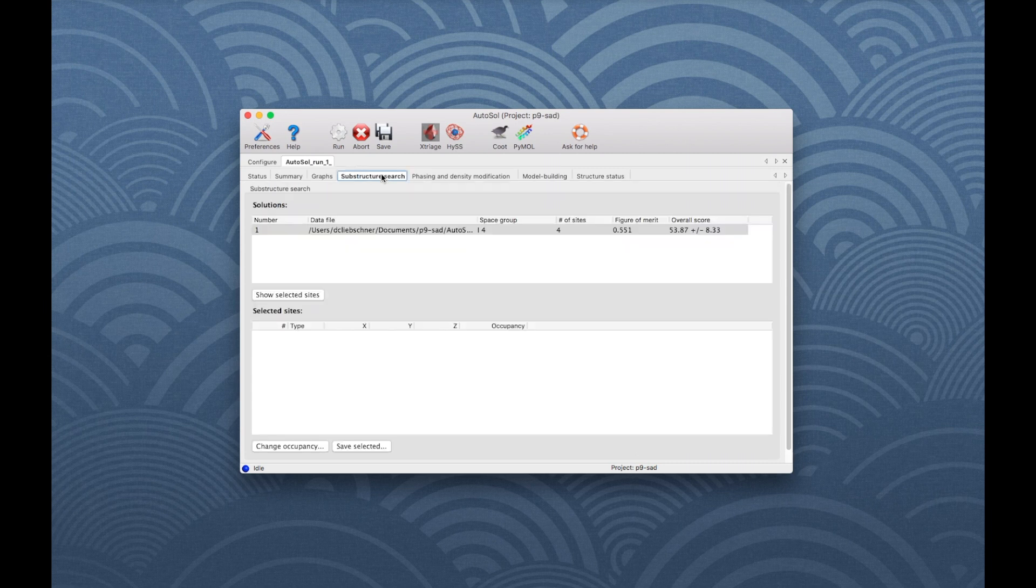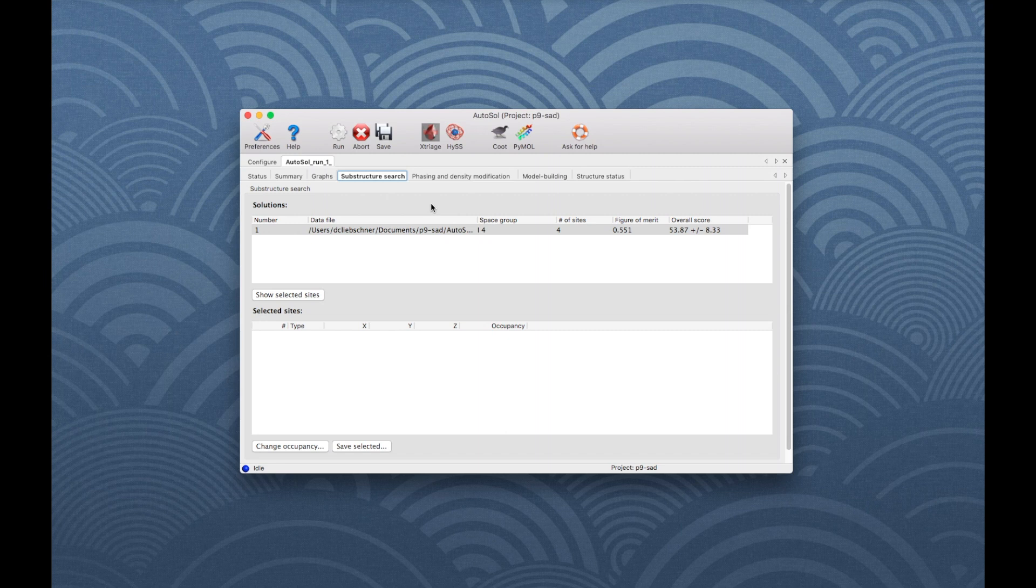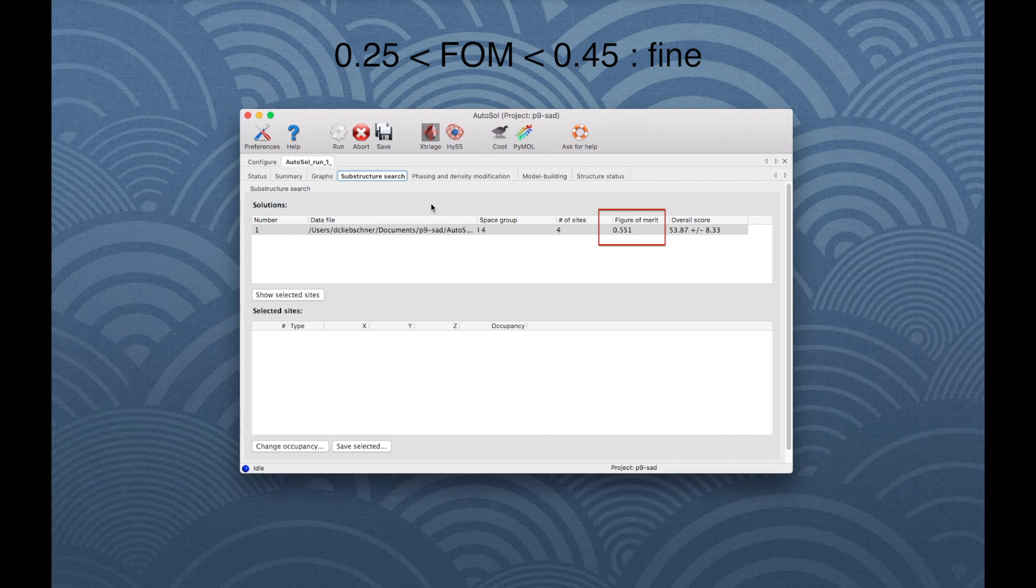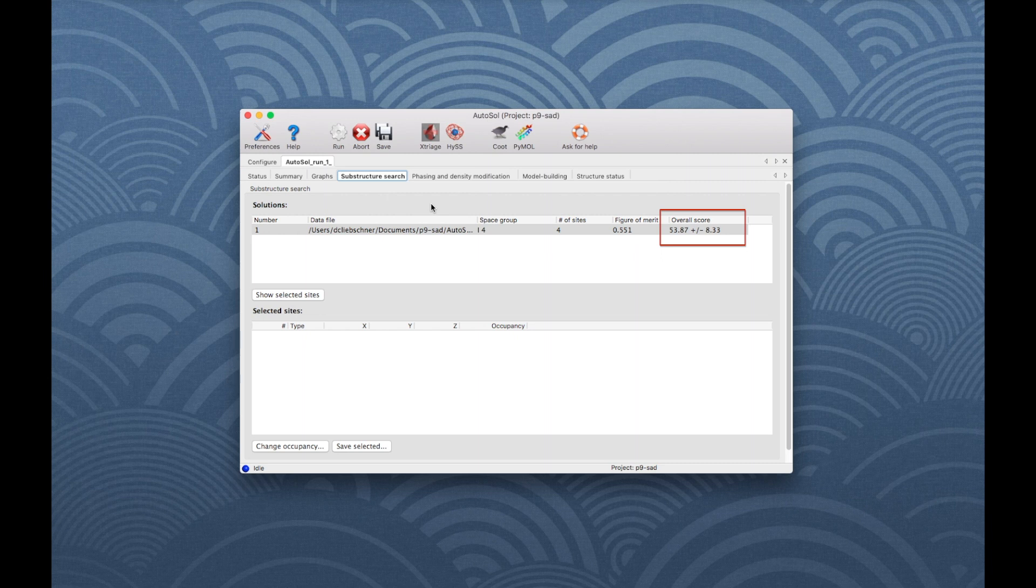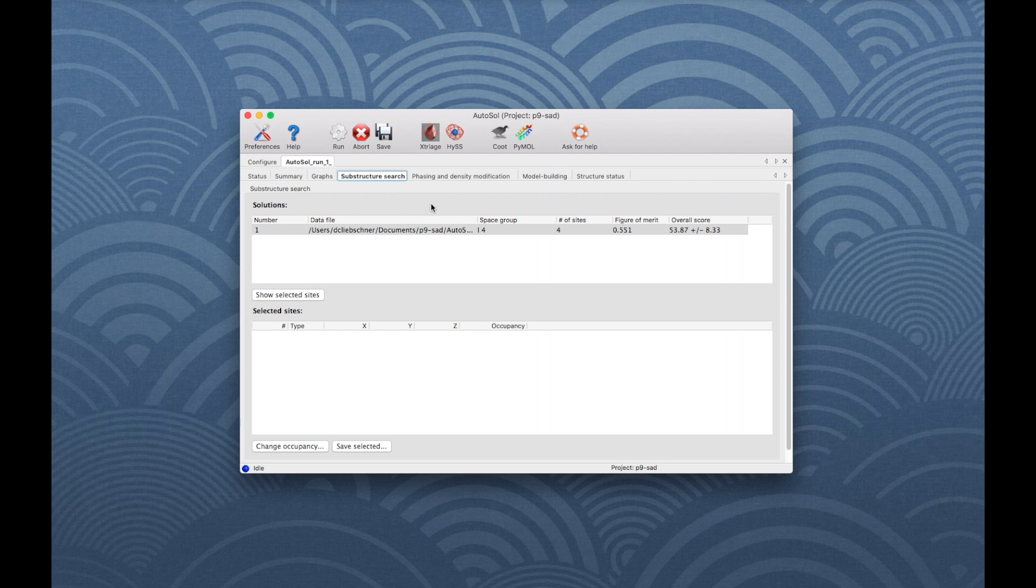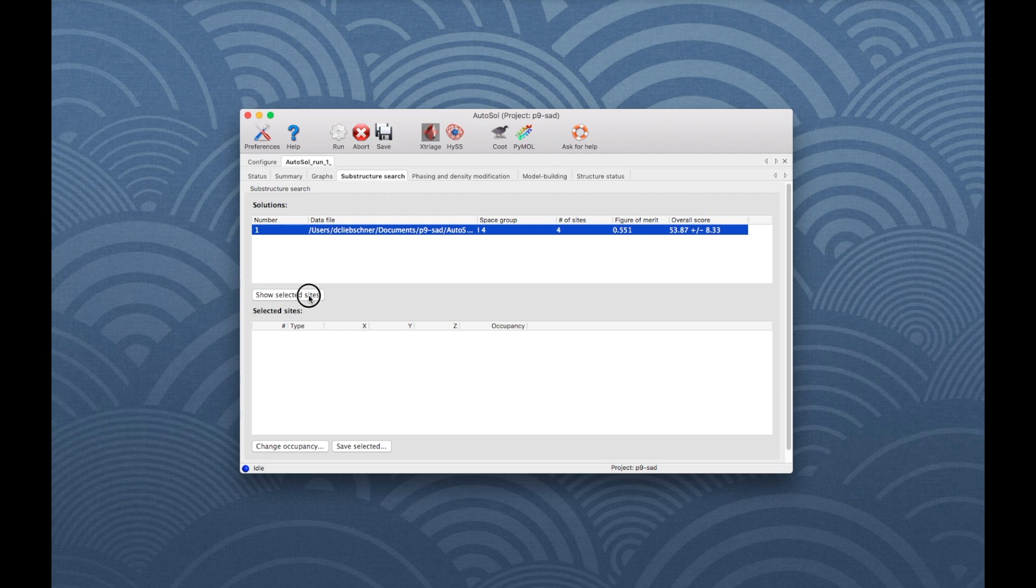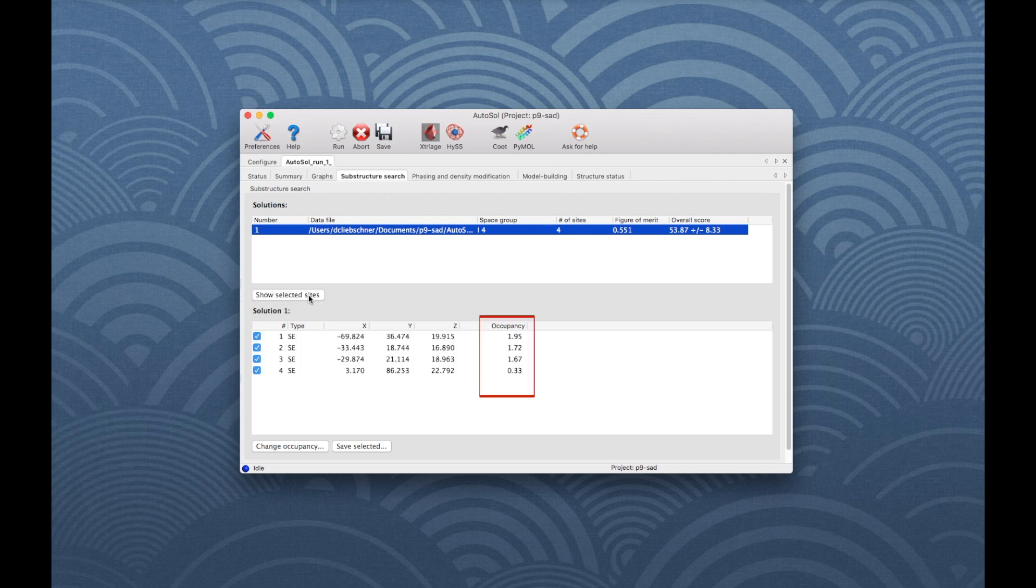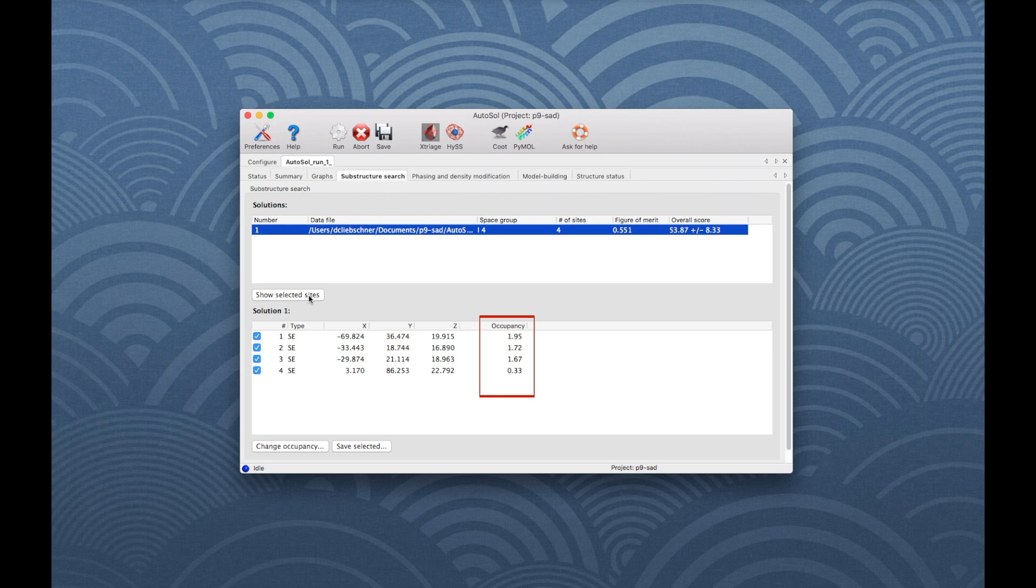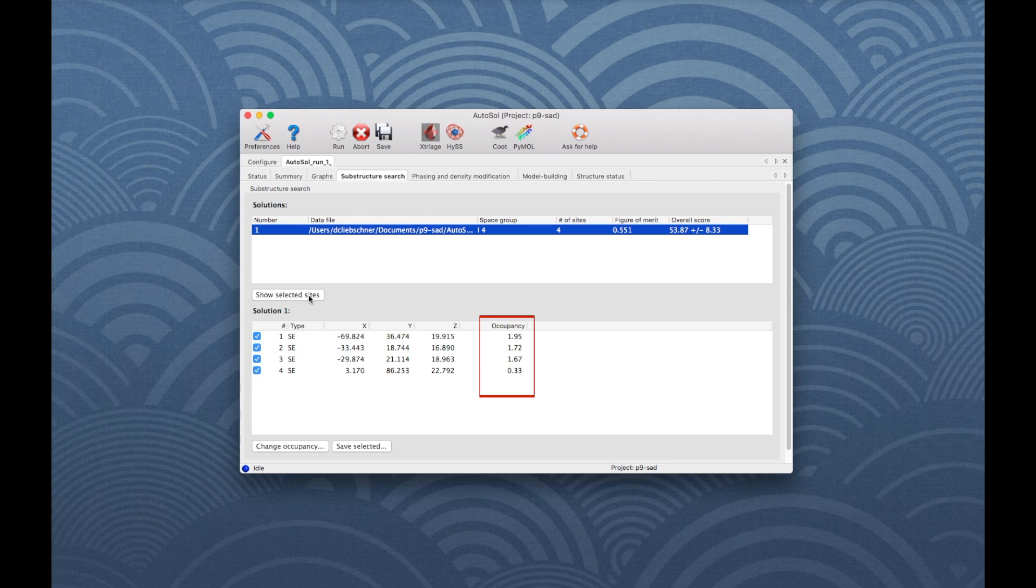The Substructure Search tab shows the heavy atom sites obtained. For SAD, a figure of merit above 0.45 is very good and between 0.25 and 0.45 is fine. The overall score is the estimated correlation coefficient between your experimental map and the true map, multiplied by 100. The higher this number is, the better the solution. Select the solution and click on Show Selected Sites, which will list below the atom type, coordinates and occupancy for each site. The occupancies should normally all be similar, but they might not all be equal to 1 if the scattering factors are not quite right or if they are partially occupied sites.